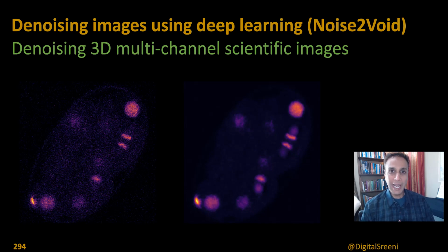Hi everyone, welcome back. In this video, we are going to look at denoising 2D, 3D images, multi-channel images using our favorite deep learning based approach called Noise2Void.